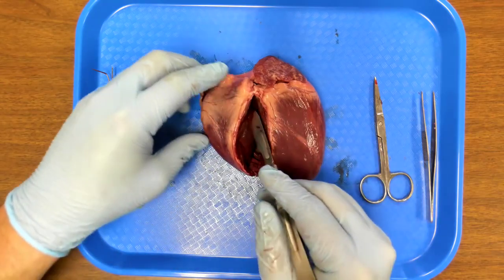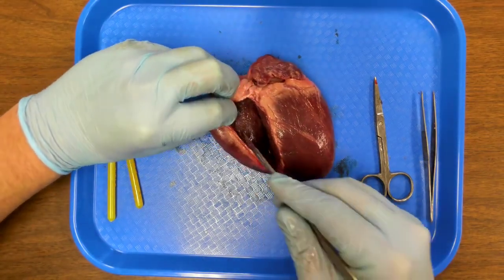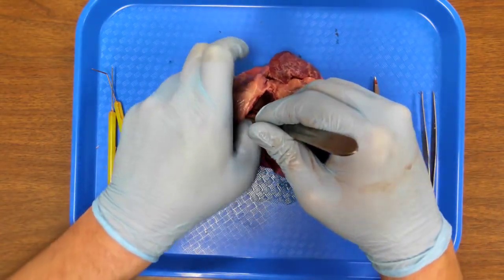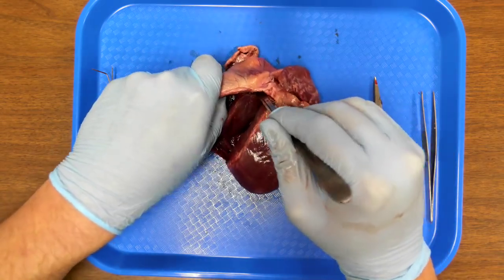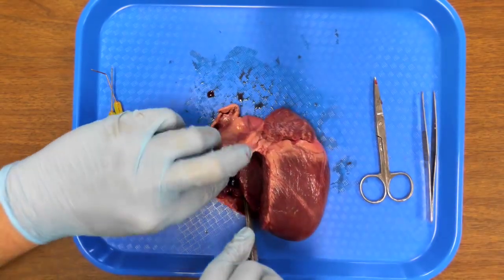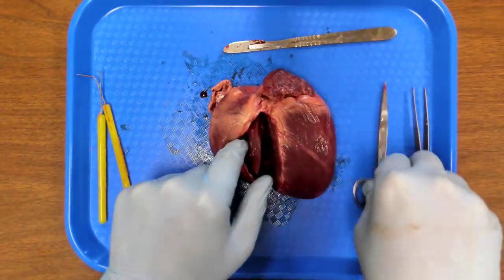Now, I'm going to cut into the right side of the heart here first. I'm going to try to just hollow this out just a little bit. So this is the septum. It is that big thick muscle that divides the heart into its two halves. Okay, I am in. Let me just clear this out a little bit so that you can get a better view.